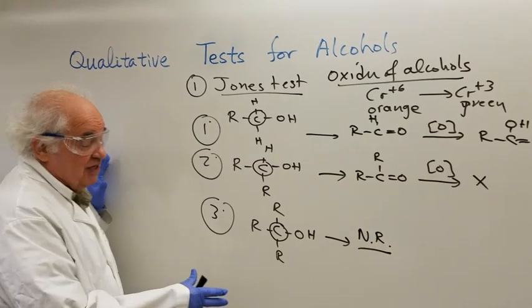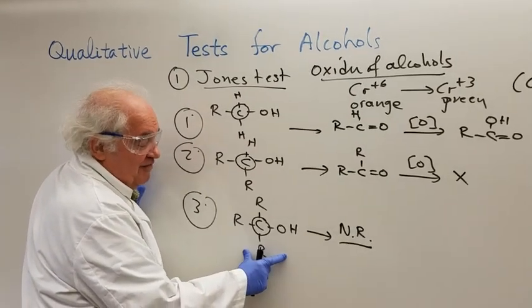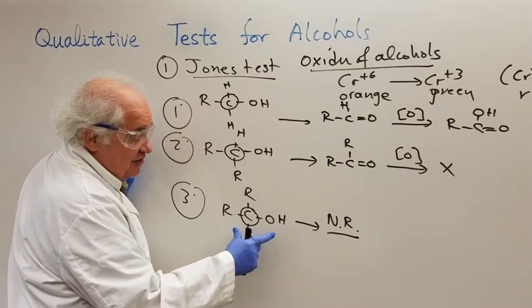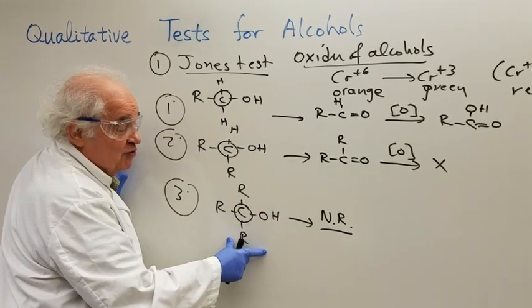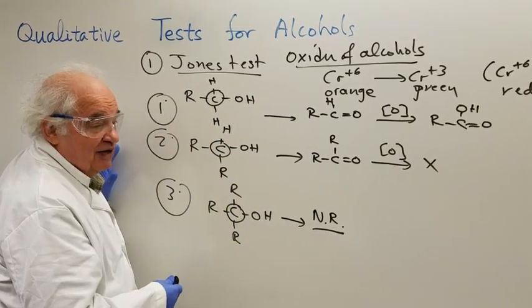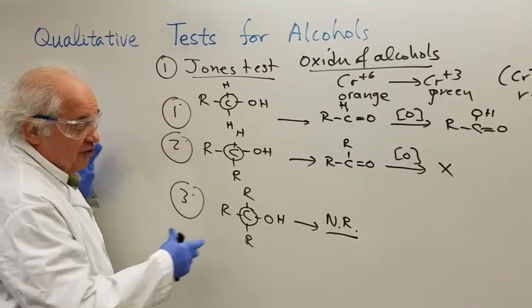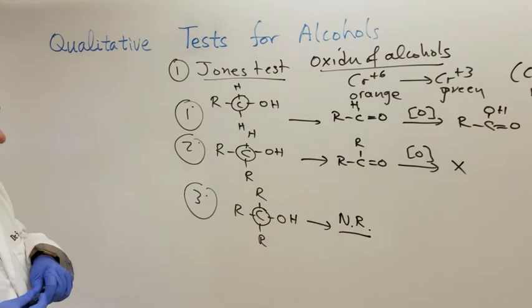But on a serious note here, some people always ask me, why don't we make alcoholic beverages using a tertiary alcohol? Well, in this case what happens is, if you drink tertiary alcohol instead of ethanol, what is going to happen to you is that you will end up in a cooler, most likely in the basement of a hospital. So therefore, you're better off drinking ethanol. Not that I promote it.